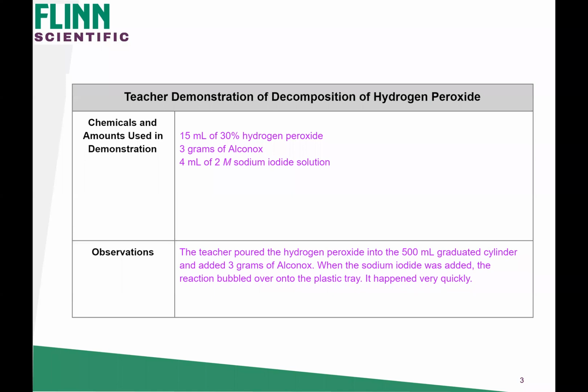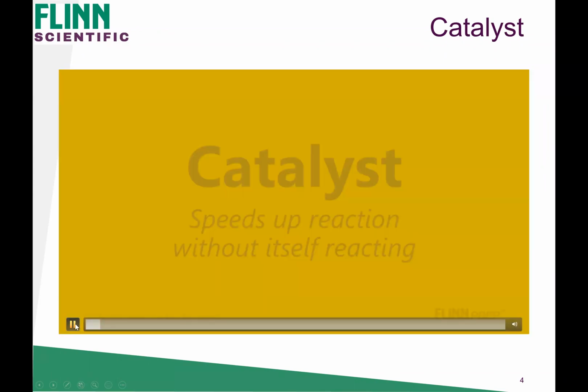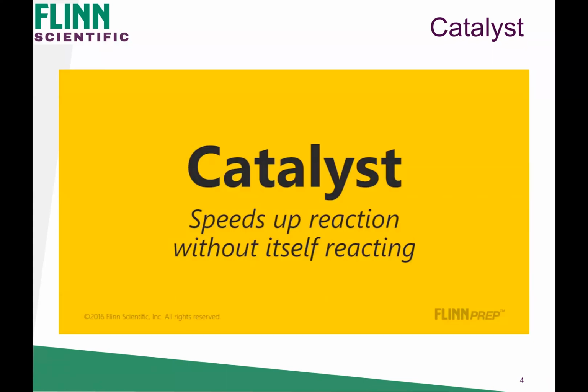Okay, we're going to add a catalyst to decompose it. And I just want you to observe, again, what a fast reaction like this looks like. Catalysts are compounds we add to reactions to speed them up. They do not react and are not consumed. They only serve to move things along.